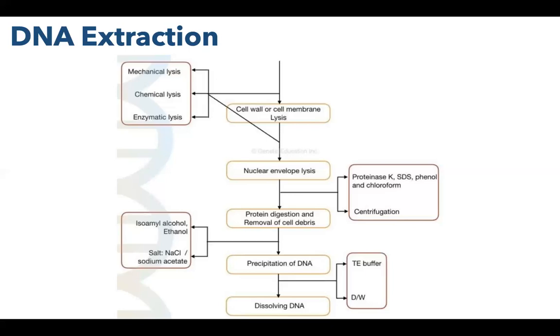So the most common reagent used to precipitate DNA are alcohols. And then finally, we dissolve DNA in an appropriate buffer and use it for other methods or techniques that we want to perform. All of these steps are, of course, performed in the presence of an appropriate buffer.